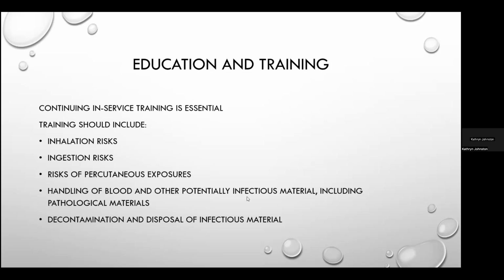There are risks of percutaneous exposures when using needles and syringes, handling of blood and other potentially infectious material, including pathological materials, and decontamination and disposal of infectious material. So these are the types of topics that should be covered in an in-service training program for the laboratory.